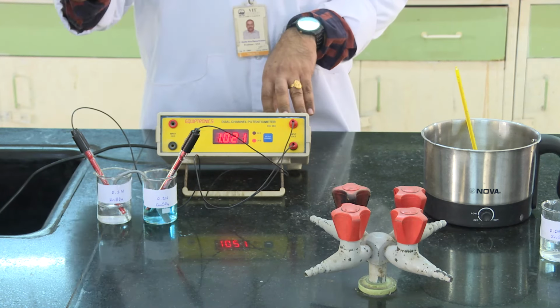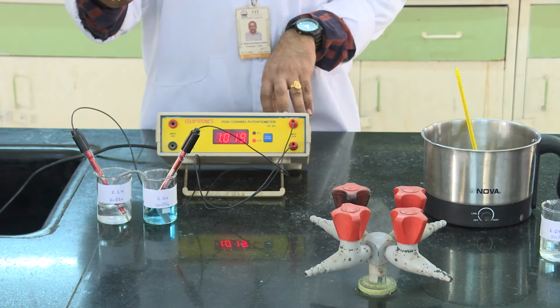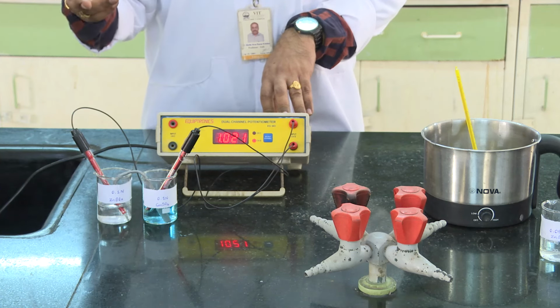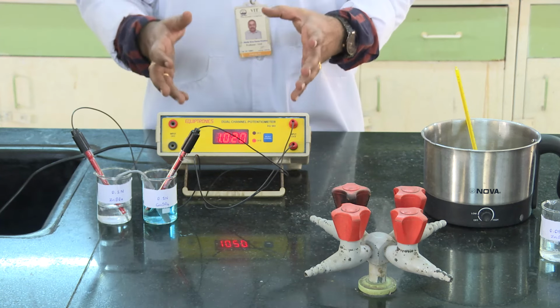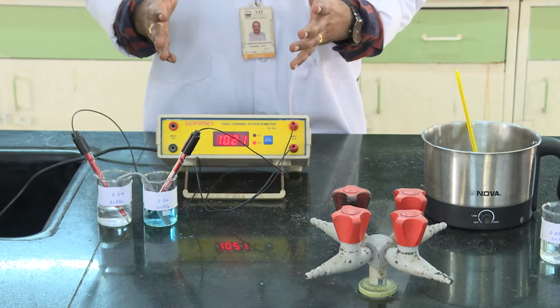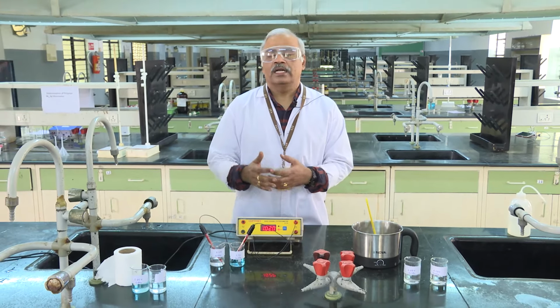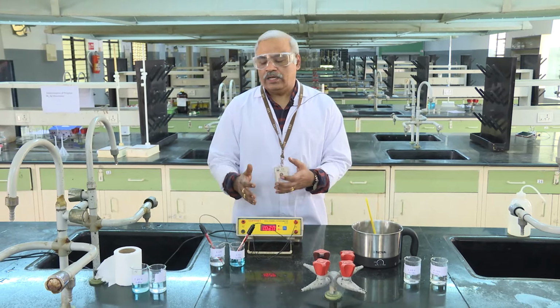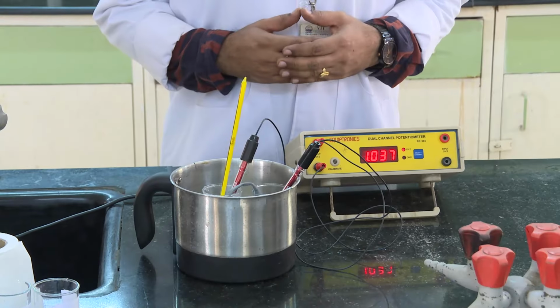You can see 0.1 normal zinc with 0.05 normal copper, as well as 0.05 copper solution with 0.1 normal zinc sulfate solution. We record the EMF values, which are all experimentally obtained. Now we use the Nernst equation to get the complete E cell potentials, and use them in the expressions for the change in Gibbs free energy. Then further we will calculate the other thermodynamic functions.